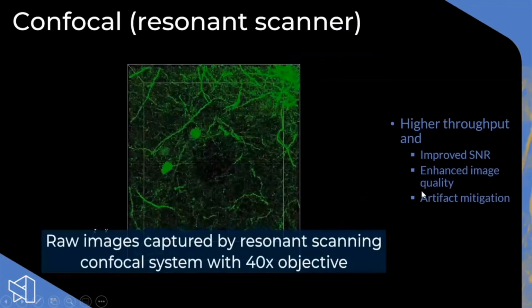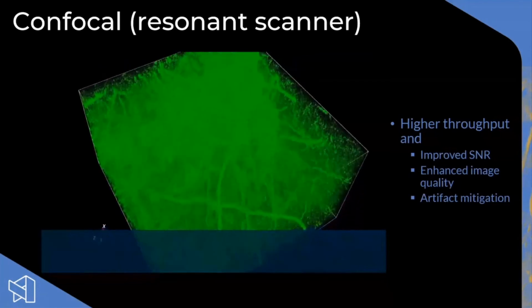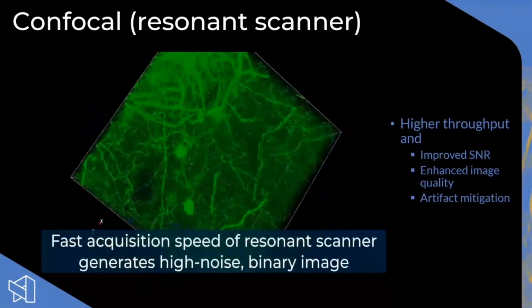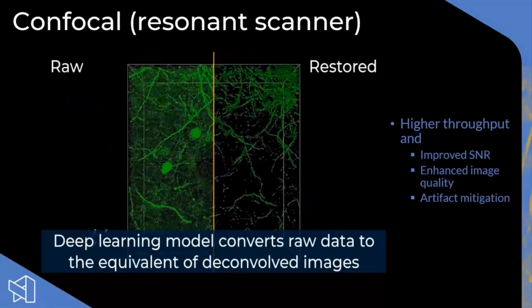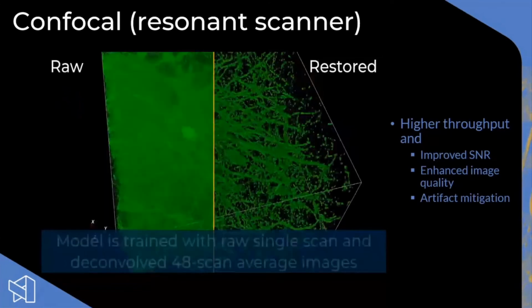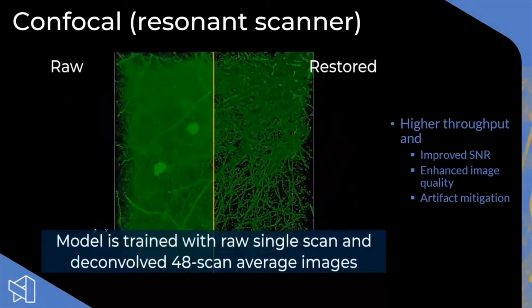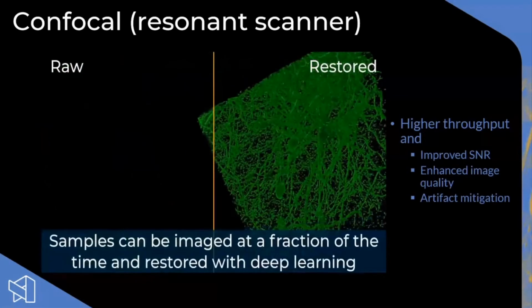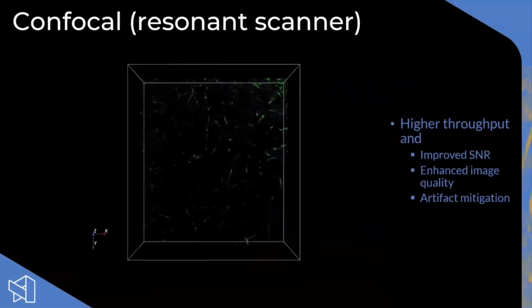So in this example, the key was not, and I mentioned this before, but I think it's important to give some nuance here. The purpose of each experiment is very important. Sometimes the purpose is, as in this case, to speed up the original imaging and still get an image that is good enough quality to do quantitation on. The purpose was not to get an image that is the same quality as the image I could get using a point scanner.